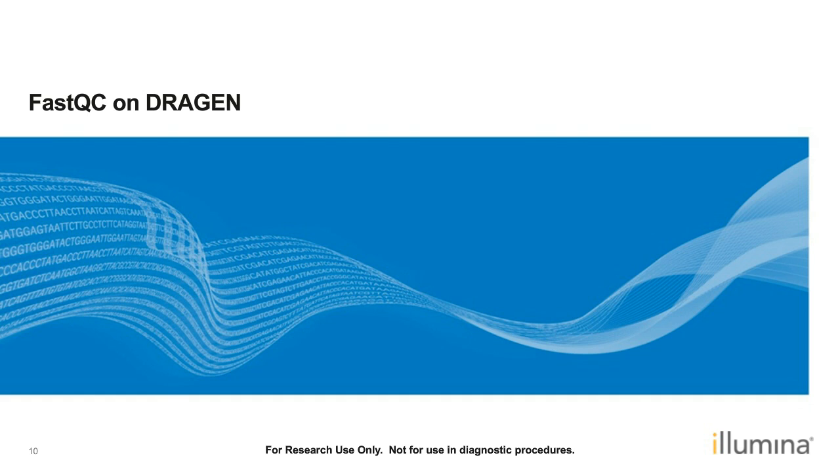So we felt that that's something that could be pulled into DRAGEN as part of our QC offerings, right? We do QC at various steps in the analysis, at BCL, at mapping, variant calling, but this is something that we felt is well suited to accelerate and bring onto the platform. So that's what we have done.